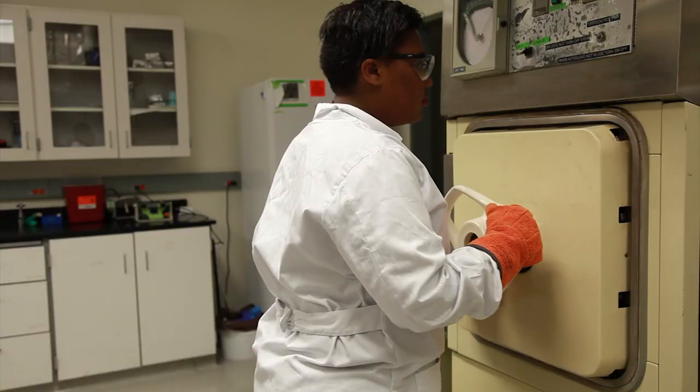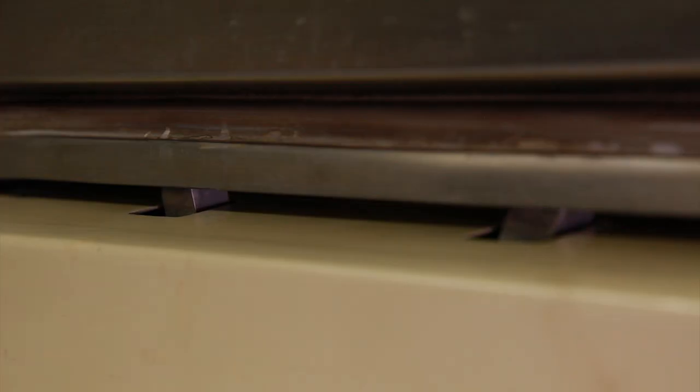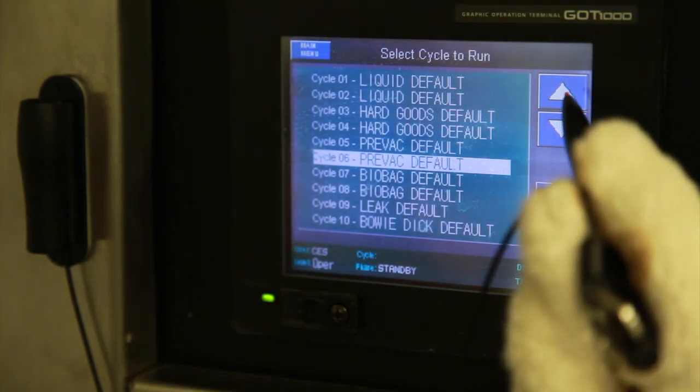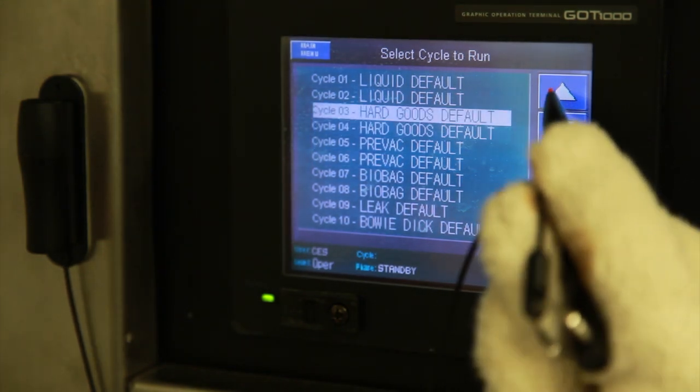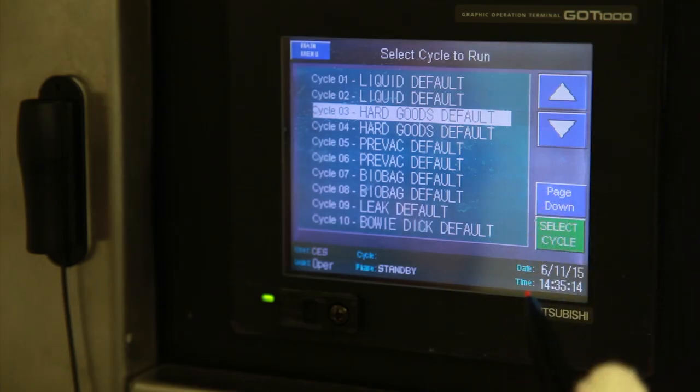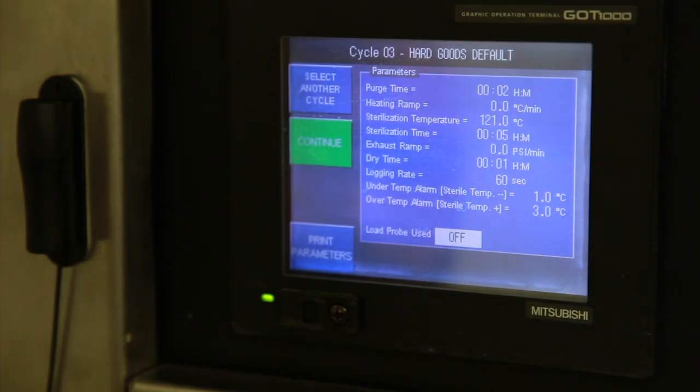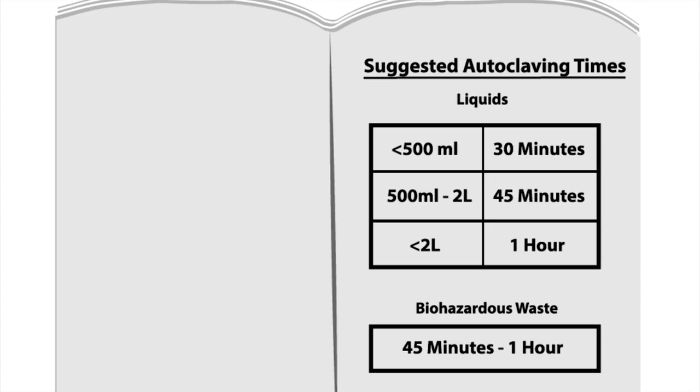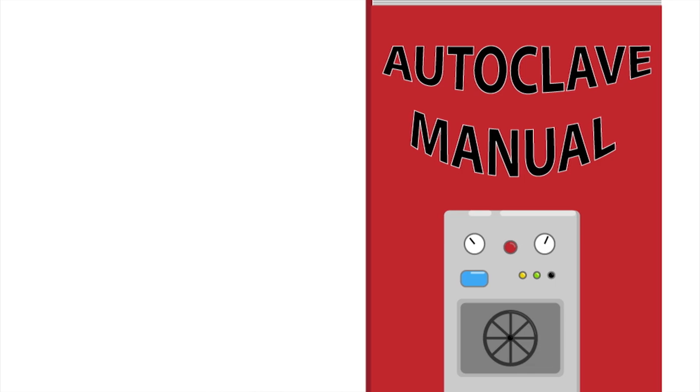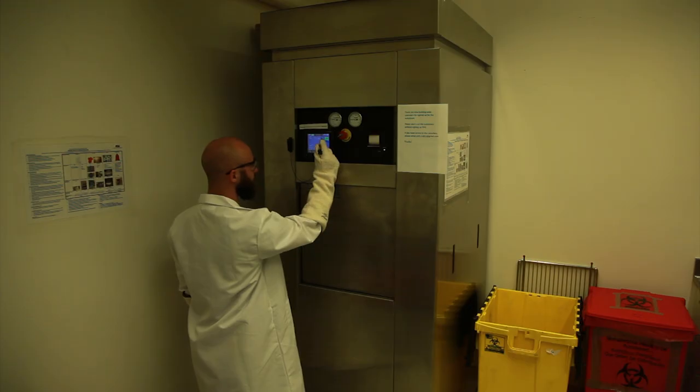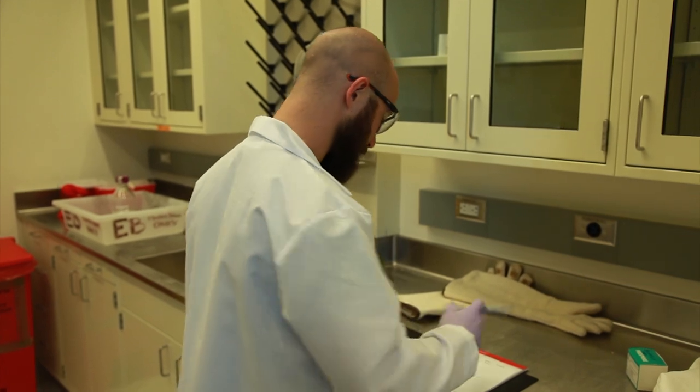Module 4, Operating an autoclave. When operating an autoclave, be sure to follow the steps outlined in your laboratory protocol. However, manuals for operation of the autoclave should be located near the autoclave. The operating protocol will be similar to this step-by-step process. Close and lock the door. Choose the appropriate program or cycle to use for the material. For example, gravity, liquid, or dry cycle. Consult the autoclave manual or your laboratory SOP for assistance in choosing a cycle. Set appropriate time and temperature if you are using a customized cycle. Be sure you consult your PI and/or the manual directions. Start your cycle and fill out the autoclave user log with your contact information if such a log is available.